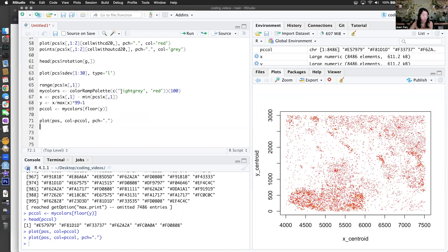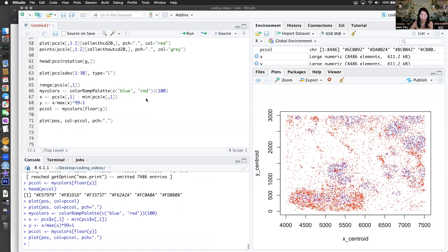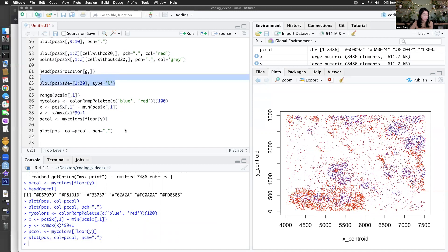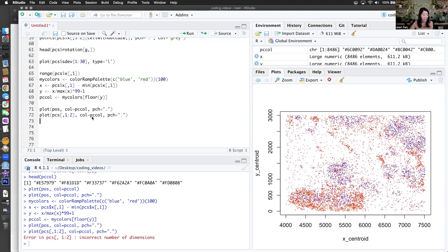Okay, maybe light gray to red is a little hard to see. This is something we'll learn about in class — human abilities to perceive between different hues versus saturations, etc. Maybe I can better distinguish with divergent color palettes. That's pretty cool — you can already start seeing some spatial patterns in PC1. And as a sanity check, if I plot PC1 versus PC2 and color it by PC1, then I should see a gradient if I did this right. There we go — okay, I did it right.